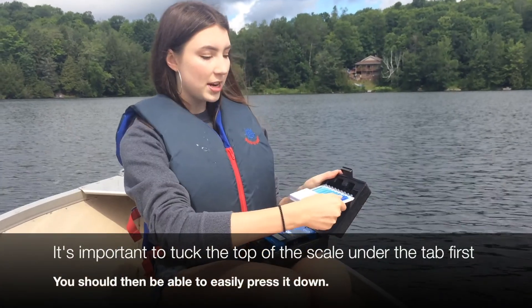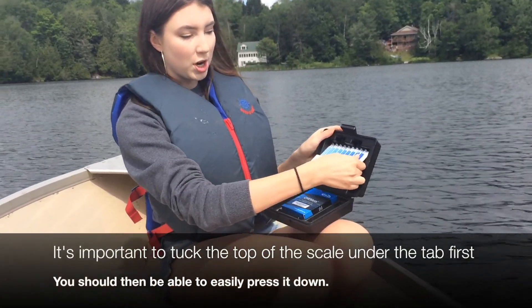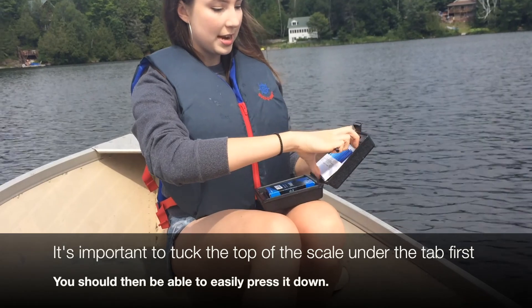To put it back in, all you have to do is put the top part in, do the reverse, and then it should snap back in.